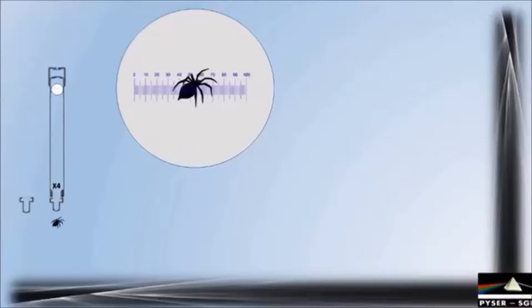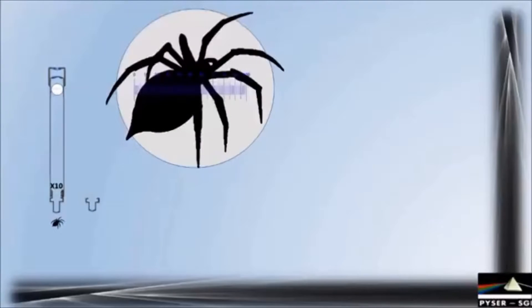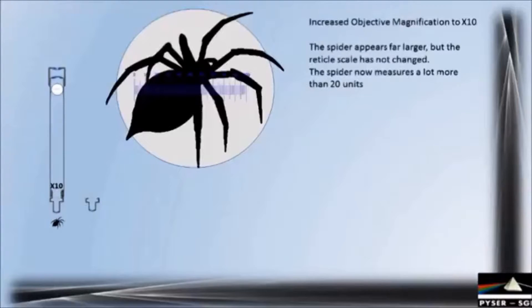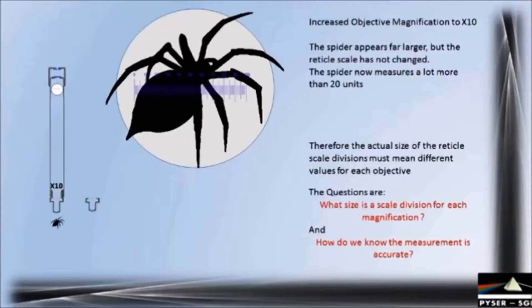Let's increase the magnification by replacing the x4 objective with the x10. As expected the spider appears much larger but the reticule scale remains the same. The spider has not really grown any larger, but if measured with this reticule scale it appears now to be much more than 20 units across. This shows that the reticule scale divisions must measure different amounts depending on which magnification is selected, so we must find out what actual size the reticule is measuring at each magnification and how we can be sure that the measurement is accurate.